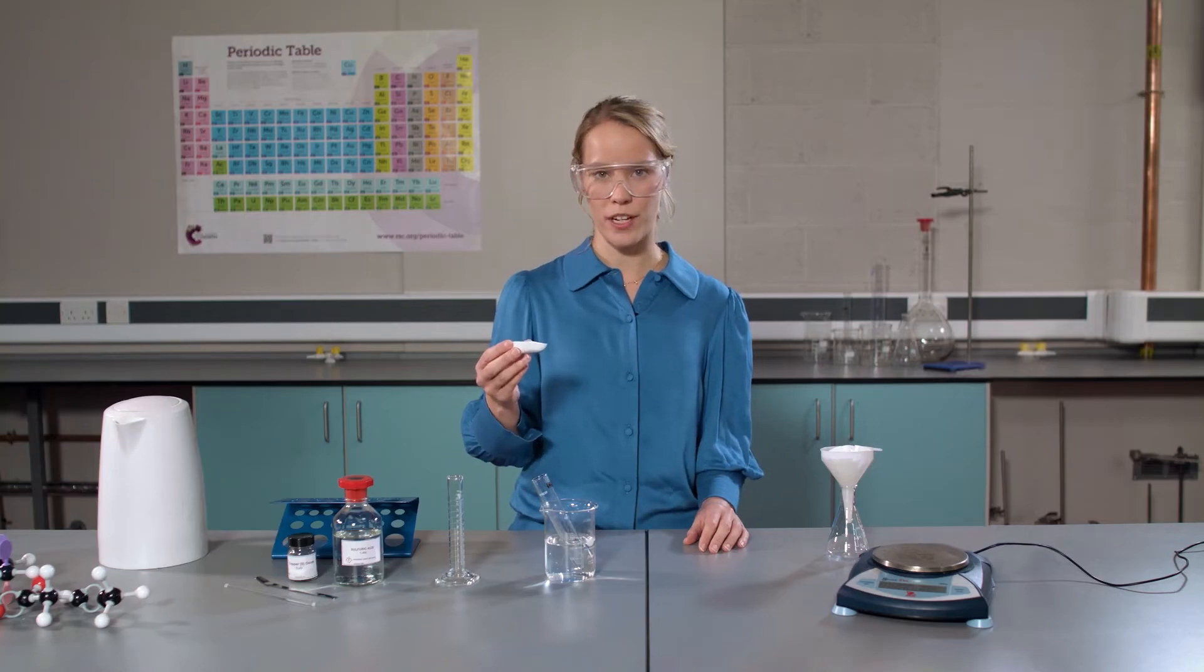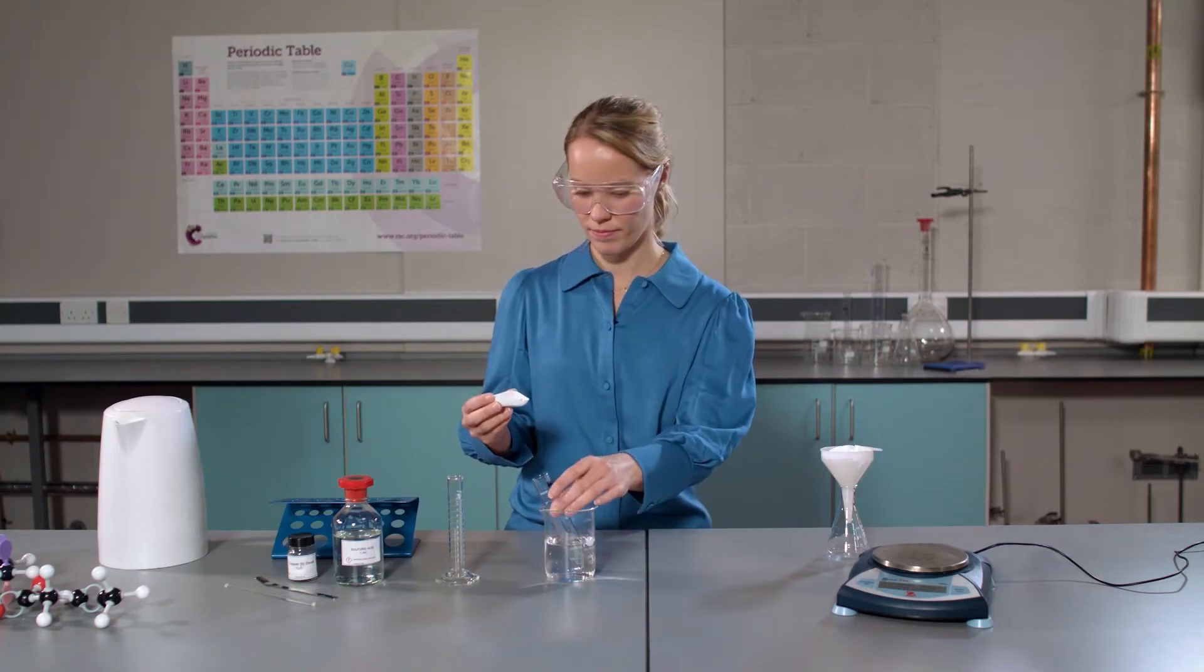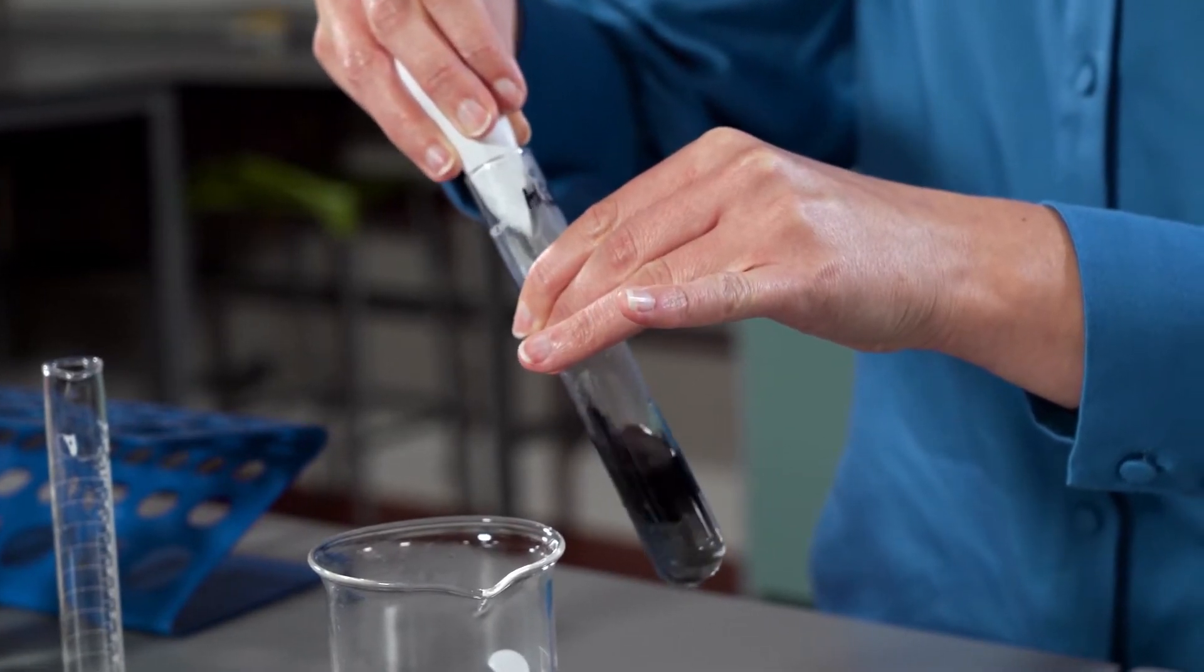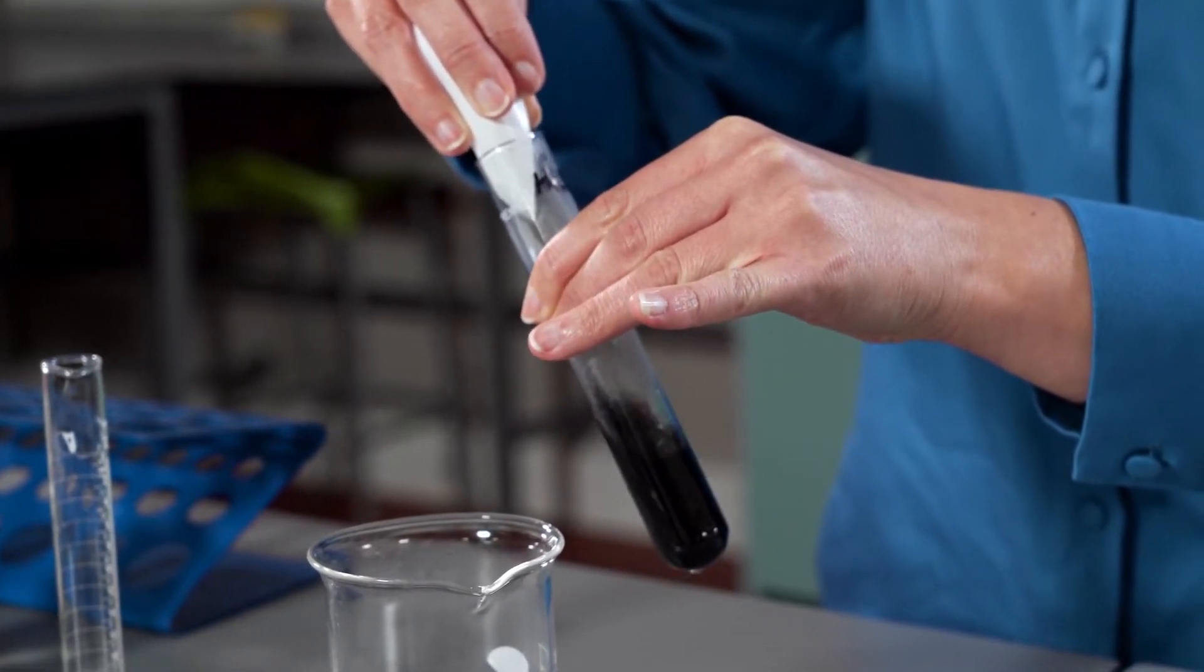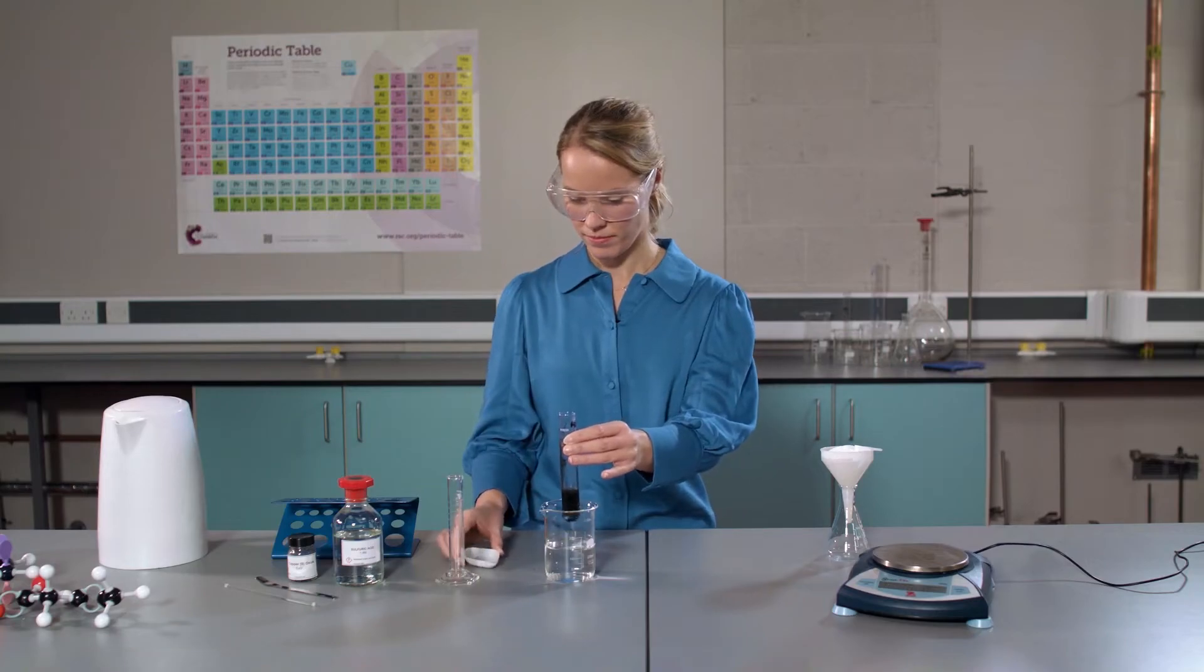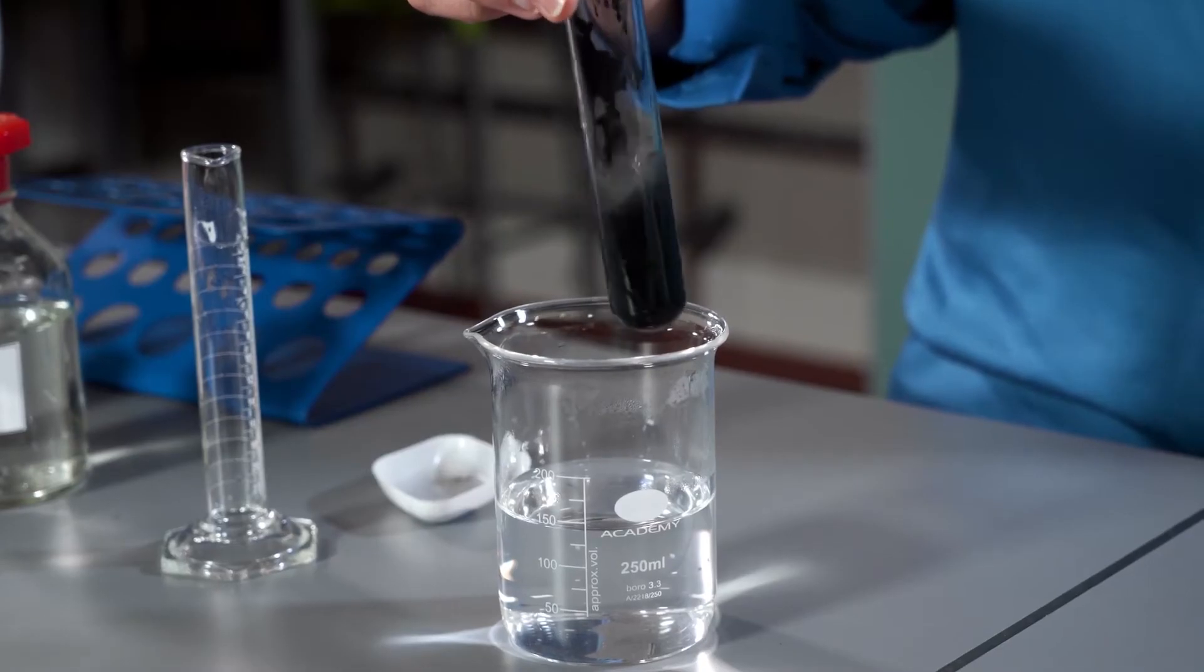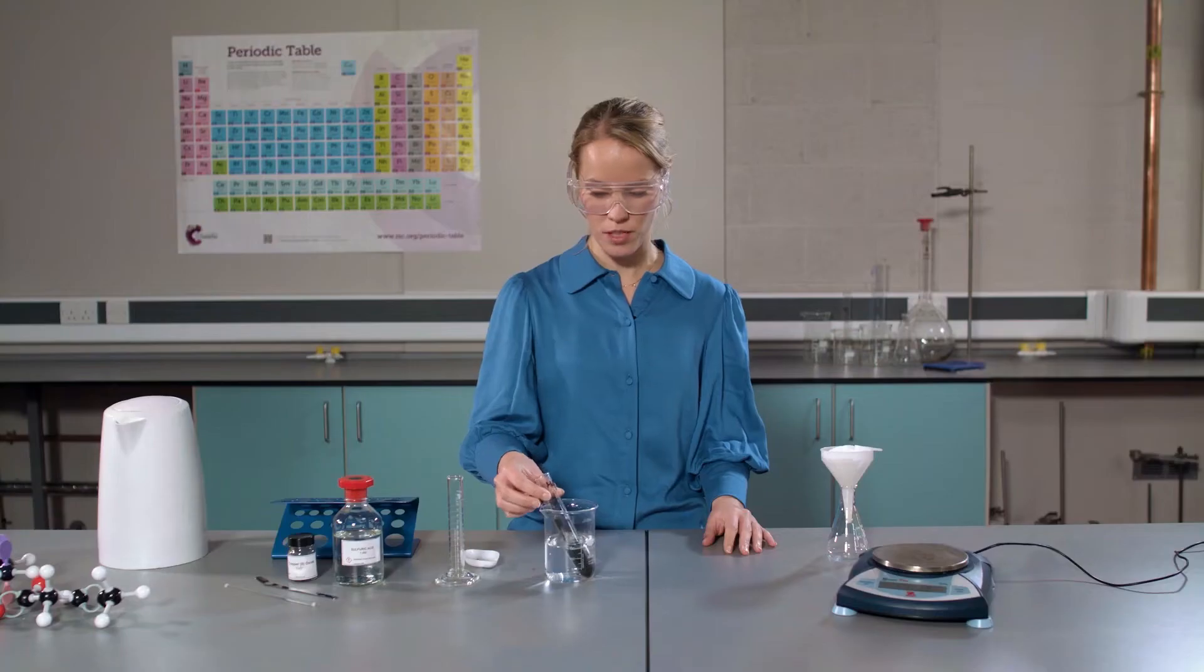Now add half of the copper oxide to the acid. Agitate gently, then place the boiling tube back in the water.